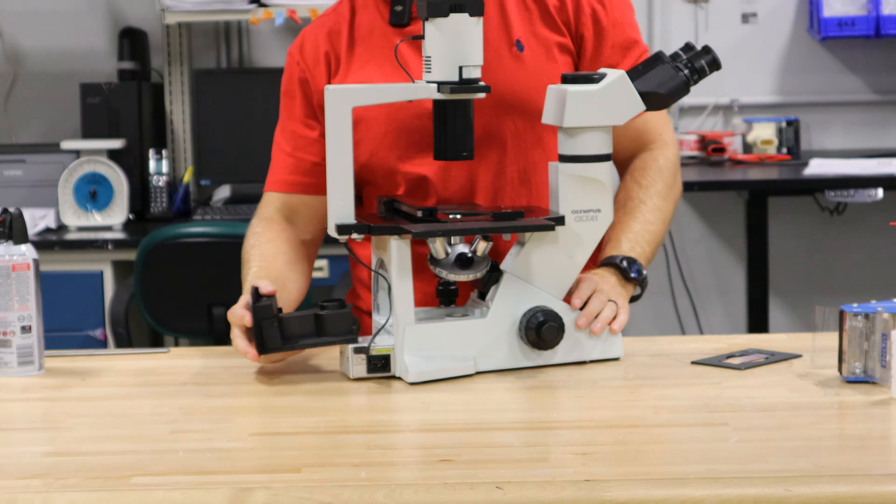So that's about everything on this scope. On this particular one, you have an on/off switch right here and your rheostat, which controls your light.